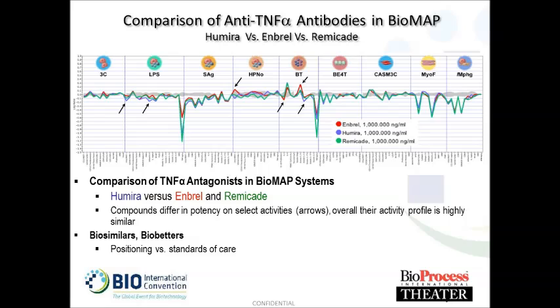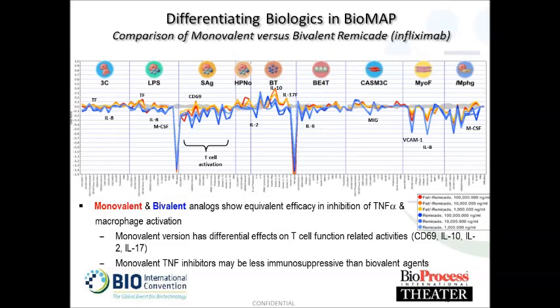But in terms of positioning a biosimilar or bio-better, right, the ability to very broadly profile your molecule across a broad set of biology, say pharmacologically, maybe the modifications that we made change the PK of this molecule, but still preserves the pharmacology or its intended efficacy. And we can do that in an even more dramatic way here. Here we've taken, in the red profiles, these are monovalent Fab fragments of Remicade, and then the full-length bivalent fragments in blue, and different concentrations of those under those colors.